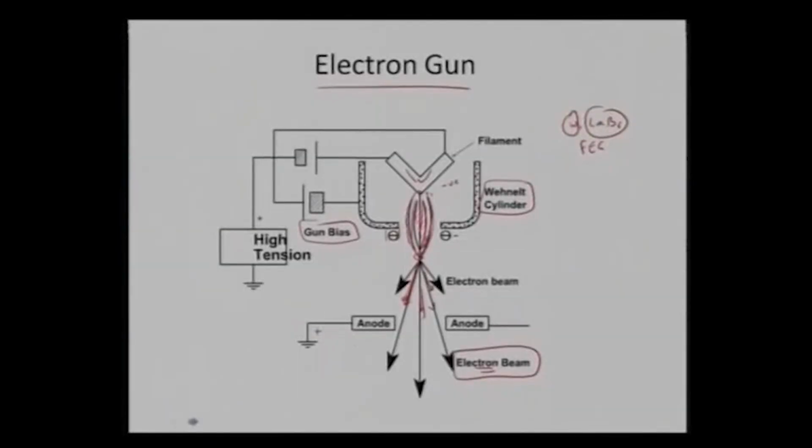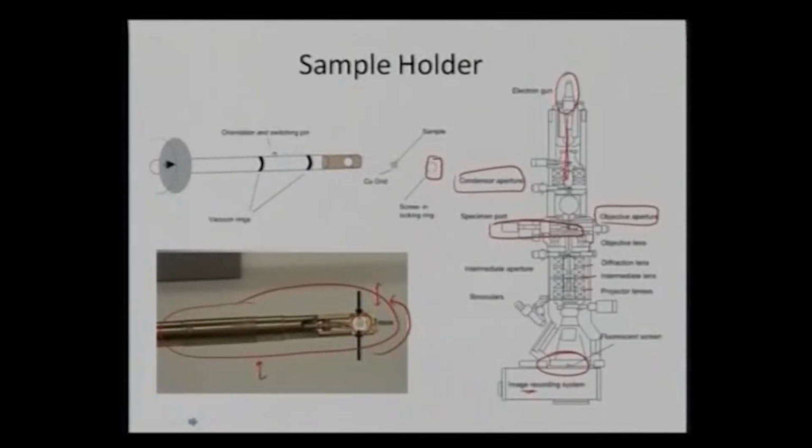But to prepare a sample, it is very critical to attain transparency to electrons. Since my samples will be mostly bulk in nature, even selecting a particular piece of sample from a bulk is very challenging, because first of all my sample has to be representative of the overall bulk structure that I really intend to look at.